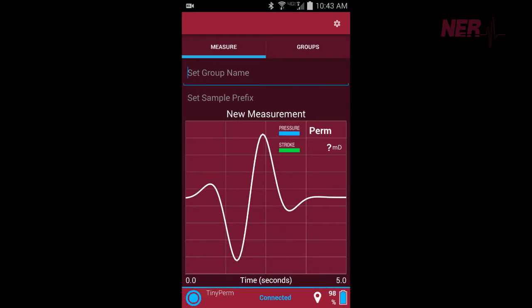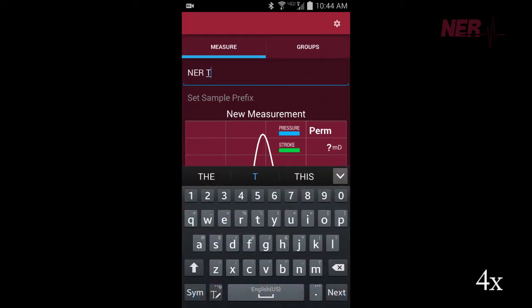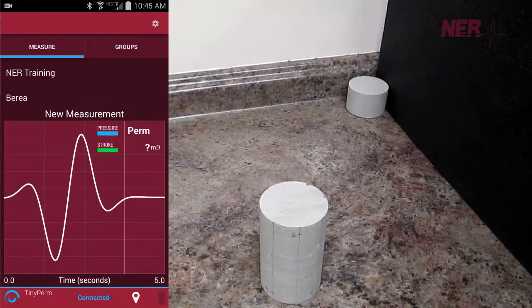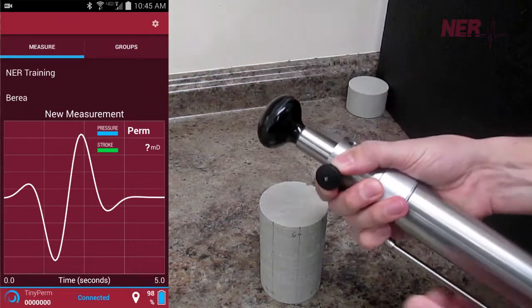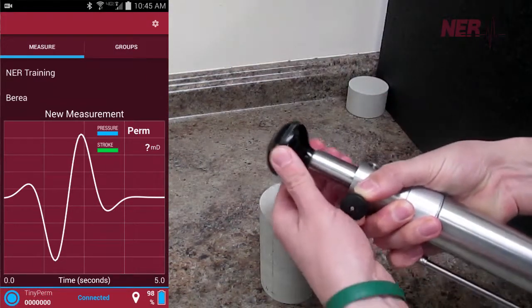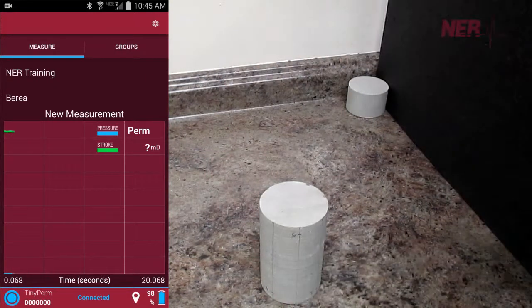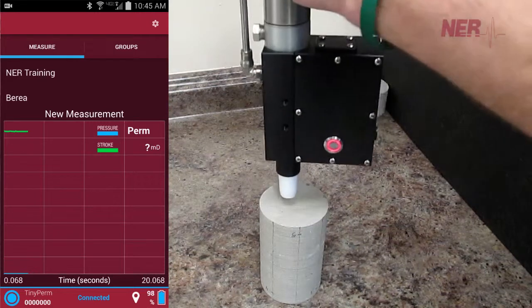Measurements are organized by group and sample name to be easily accessed after field measurements are concluded. To conduct a measurement, the operator presses a rubber nozzle against the specimen and withdraws air from it with a single stroke of the syringe.